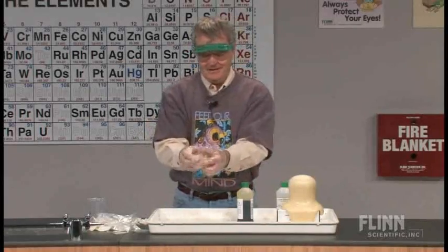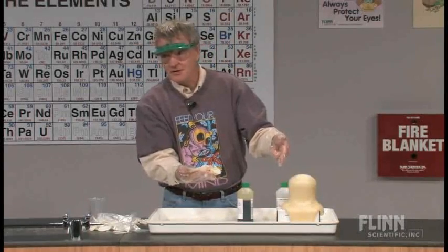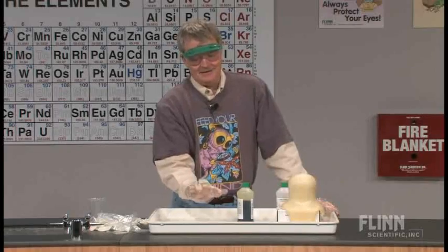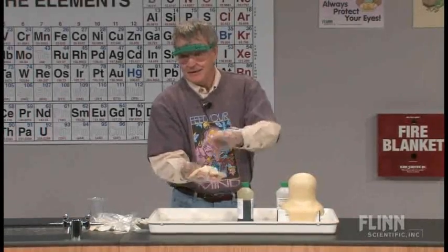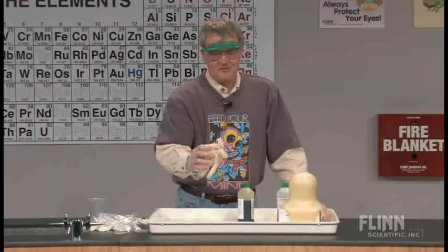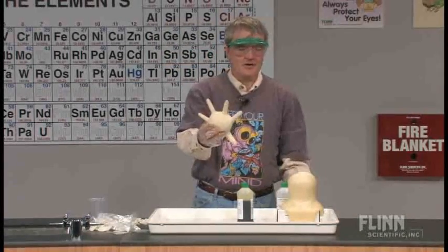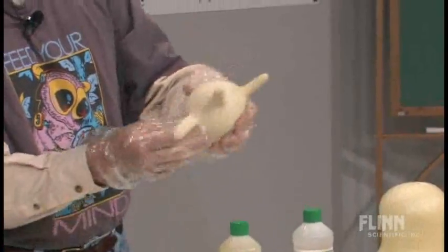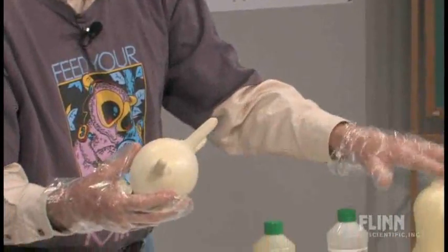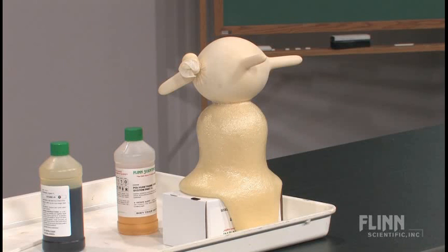Now this is an important safety note: shortly this is going to start to expand, much like the cup is doing. The glove will get bigger and bigger and occasionally it will burst. If the polyurethane foam system hasn't set yet, it'll shoot the stuff out — so this is not something you're going to pass around in class. Don't give it to one of your students to hold in their lap. You can see it's starting to grow now. The principal comes in — it's a great thing to have them hold onto. That's about set, so I'm going to put that on top of there. That's the polyurethane foam system in the glove.